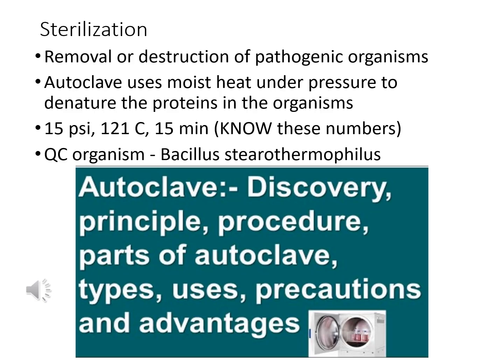For quality control, or QC, your autoclave needs to have this done as well. The procedure is that it's usually a little paper strip that's been impregnated with Bacillus stearothermophilus, and there should be a color change if your autoclave has reached the given parameters. And those parameters are 15 psi, 121 degrees Celsius for about 15 minutes. I've also included a short video on the slide if you'd like to see firsthand a little bit about how it actually works.